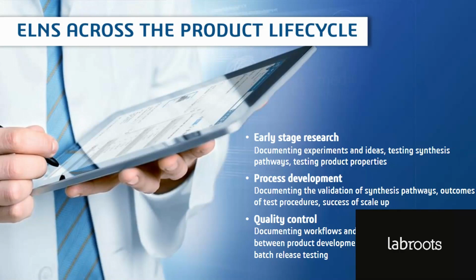As you move into process development, a LIMS might be the most commonly thought of informatics product, but an ELN is also useful to document the progress of projects. And you could document the validation of synthesis pathways, the outcomes of different test procedures, et cetera, as you move to measure the success of your scale-up efforts.